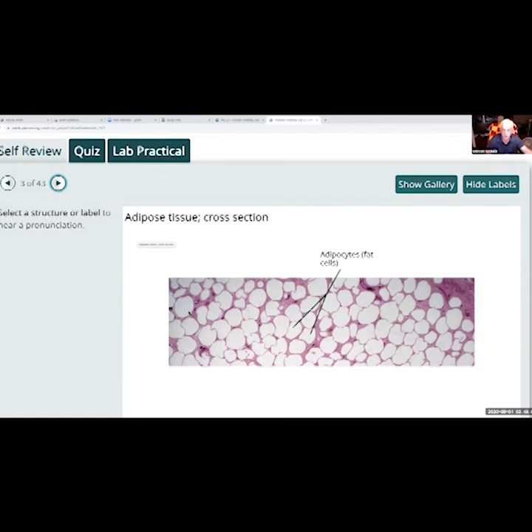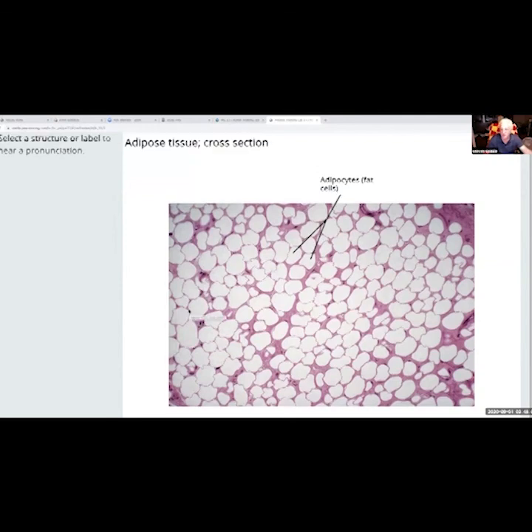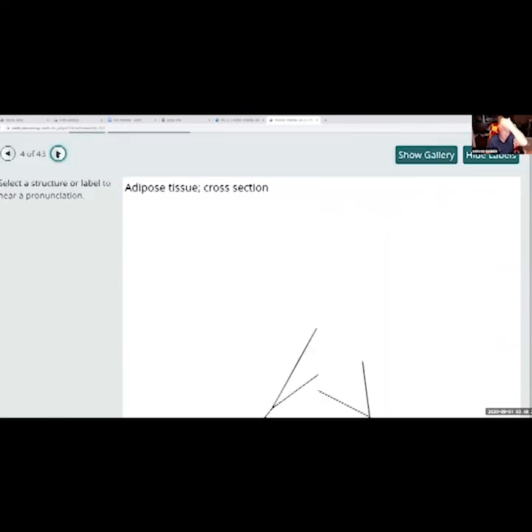All right, this you should never miss on your nursing exam. Big white cells are fat cells. You don't see a nucleus. You don't see anything. They're just full of fat. Whenever you see this, these are fat cells. They're adipose cells, adipocytes. They're distinctive. You can't miss it. No one should miss that in your nursing exam. Those are adipose cells, adipocytes.